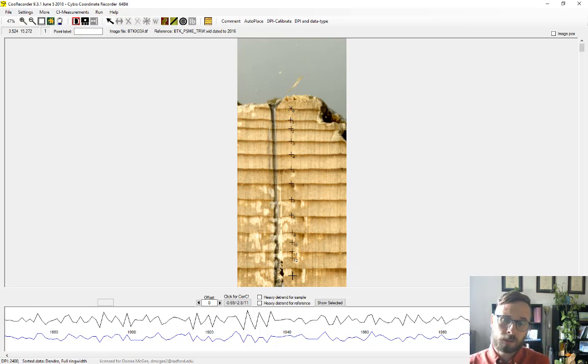And what it has done is it's looked at the lightness and darkness of those pixels and marked a boundary where it sees an abrupt transition. So you'll see it does pretty well up here, but because we have some rot in this wood sample, and you might have this discoloration of some sort, it will try to mark boundaries of other sorts.